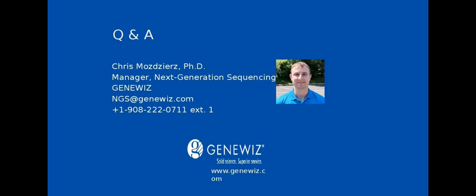So can you elaborate a little more on the limitations of PacBio sequencing? Sure. The really good thing about PacBio sequencing is that the read lengths are very, very long. However, there are some things that you need to consider. The throughput: right now, each chip on the smart cell of the Sequel is about 350 to 500,000 reads. This is in comparison to a MiSeq run, which could generate about 15 gigabases worth of data. So it's orders of magnitude more data than the PacBio.